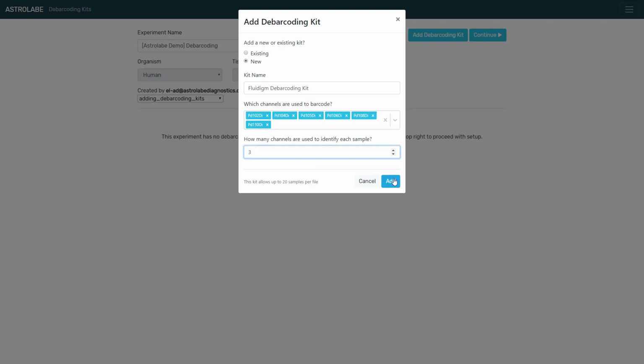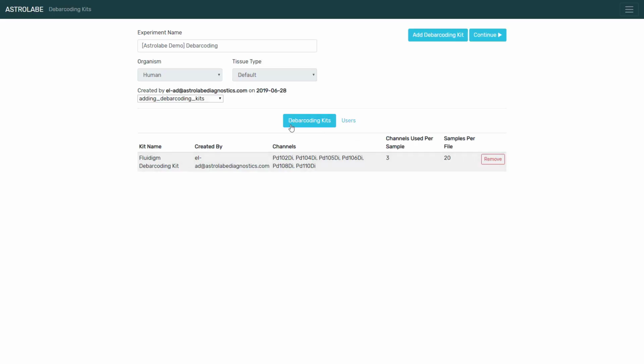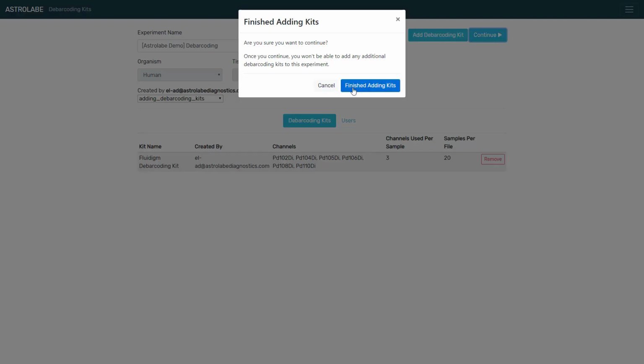Once I'm done, I can add the kit, and I will see it listed here, including the channels and the number of channels per sample, and how many samples I can expect to find for each file I uploaded. Once that is done, I'm going to click on the Continue button and Finished Adding Kits.